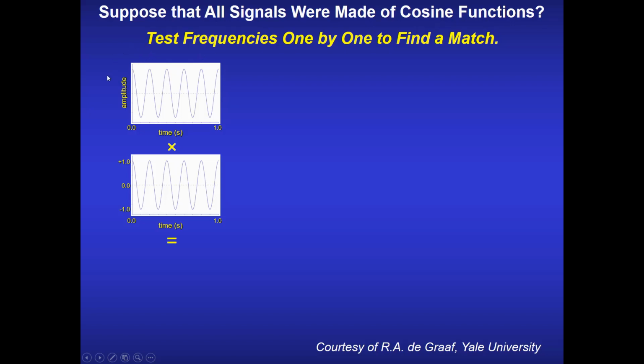Now, we're going to do just a simple cosine transform. This is our observed signal, and we're going to test it against some signal that we want to know if it maybe forms part of the spectrum. So if we take this signal and multiply it by our test signal, it can oscillate between 1 and -1, for example. What matters here is that it's exactly this particular frequency. And look, they happen to be the same, so our initial guess in this case is correct.